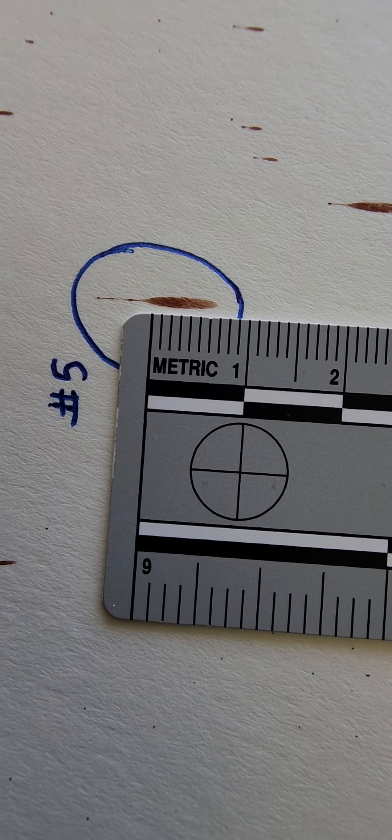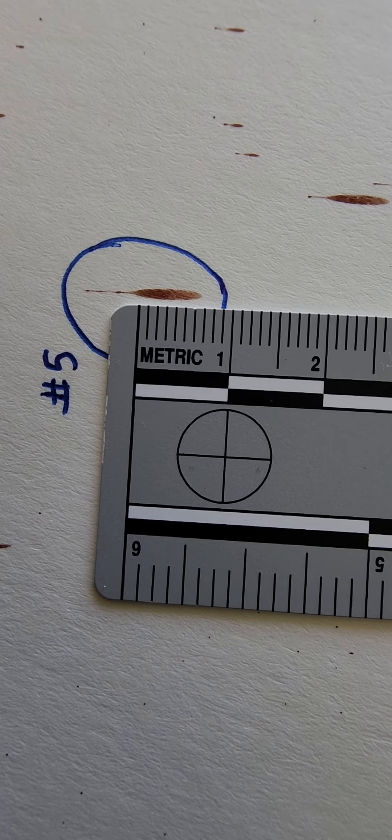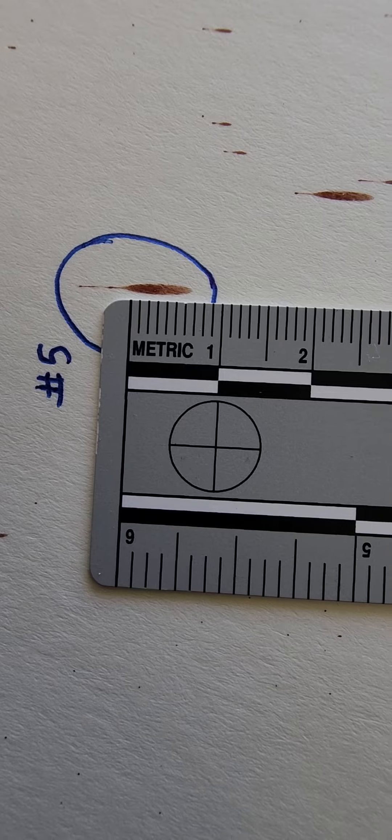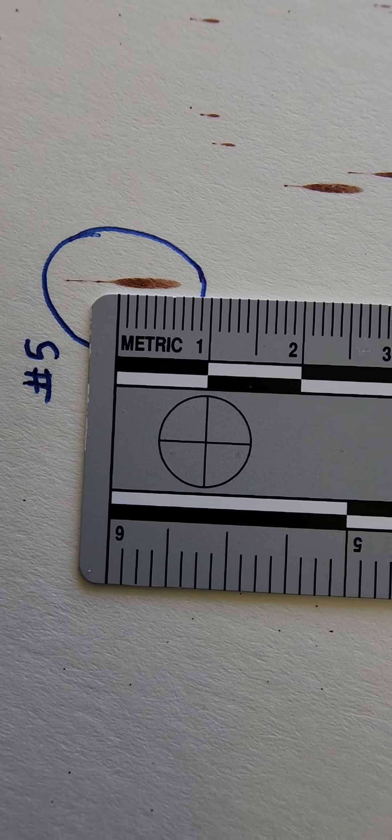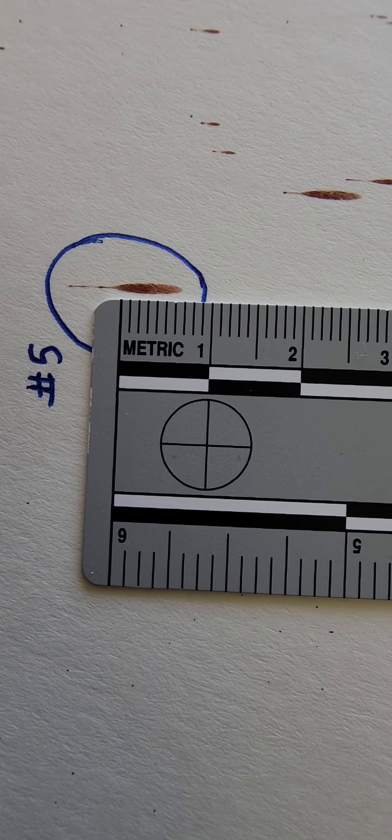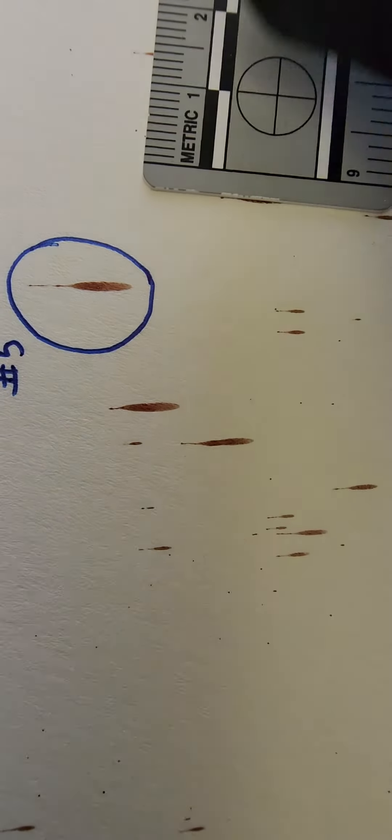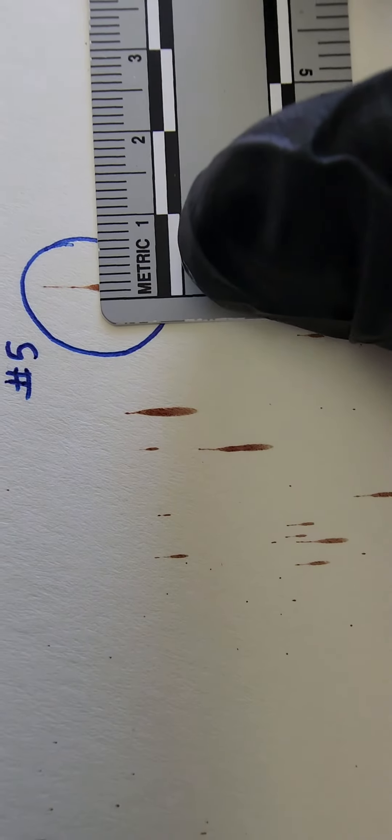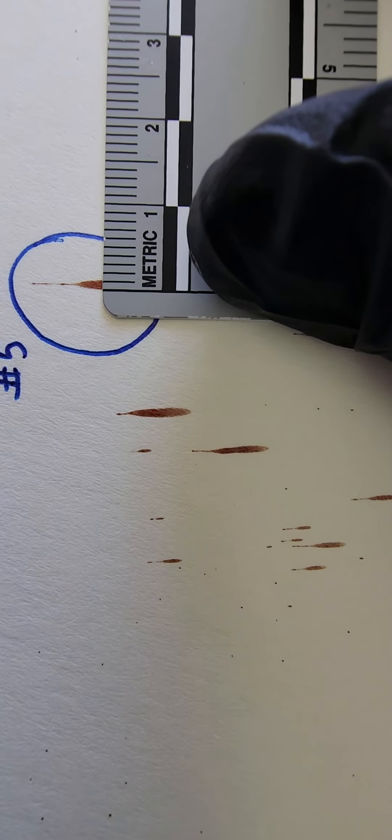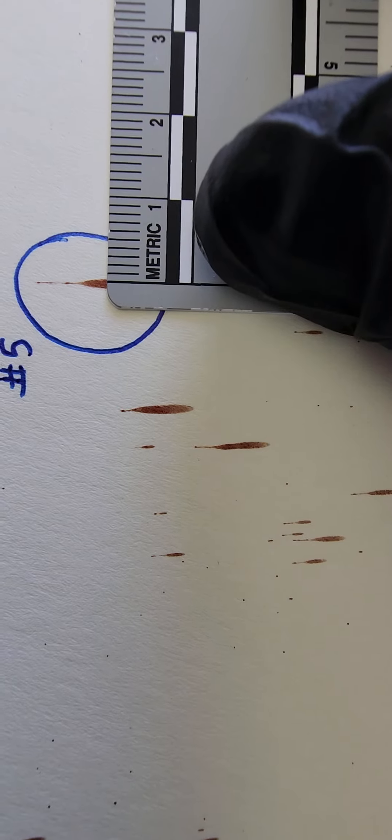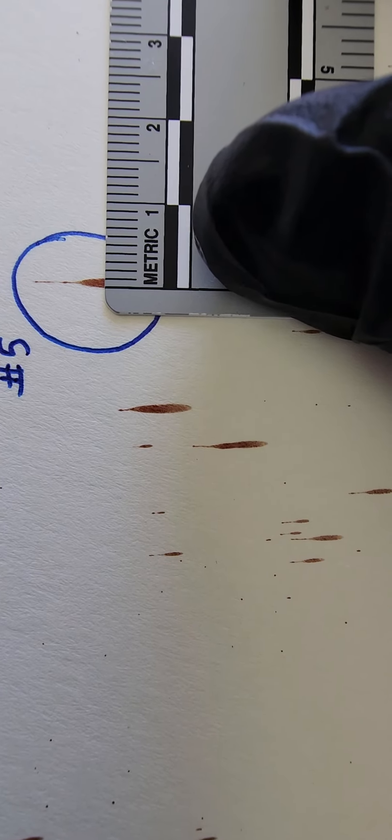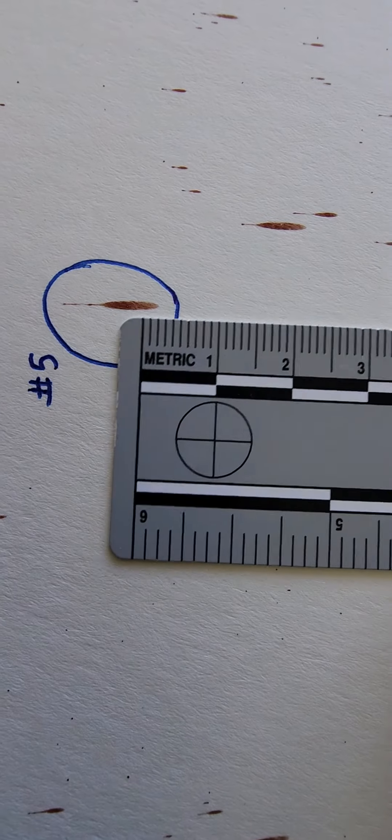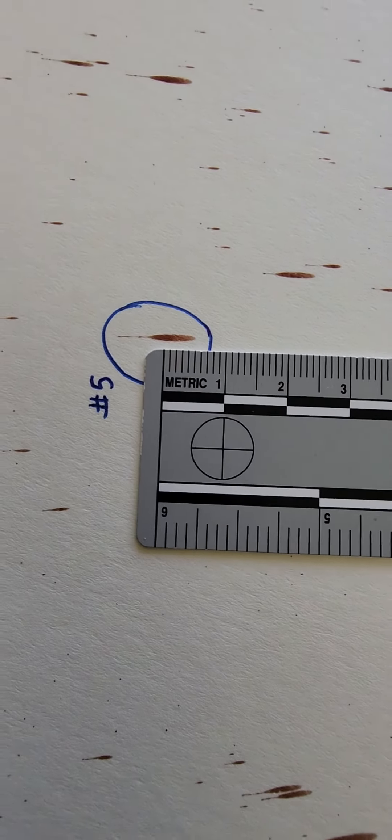So looking at this here, I would say this is about one, two, three, four, five, about six and a half millimeters in length stain. And then you also measure your width. So the width is one millimeter. The width of the stain is one millimeter, the length is six and a half millimeters.